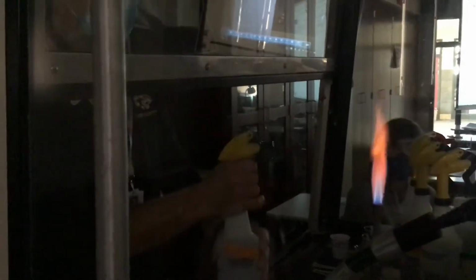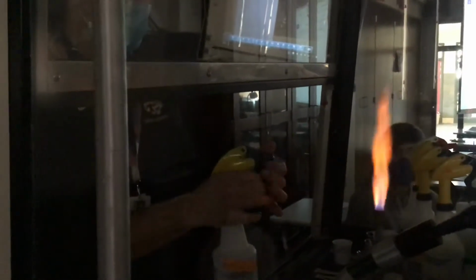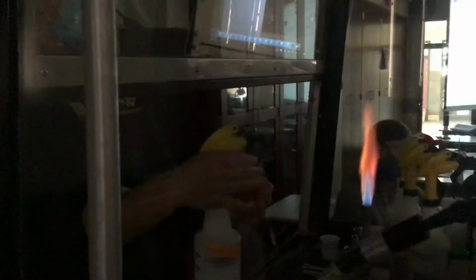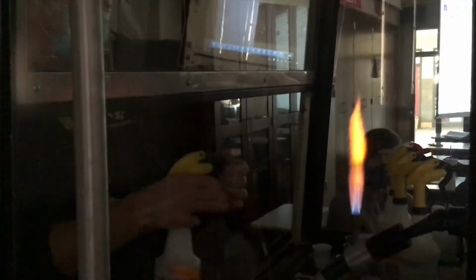The sodium spray bottle doesn't work quite as well as the other ones. Usually it just got really messy. Let's see what I did. It just kind of sprays a stream. I don't know if I can get the sodium one to work. And this one caused me to get burned yesterday, so I might give up on the sodium one. You guys saw the color though, didn't you? All right, let's move on from there. We won't do sodium in the spray bottle.